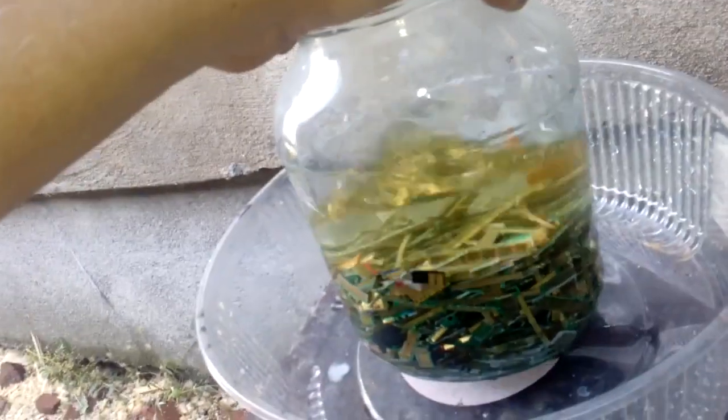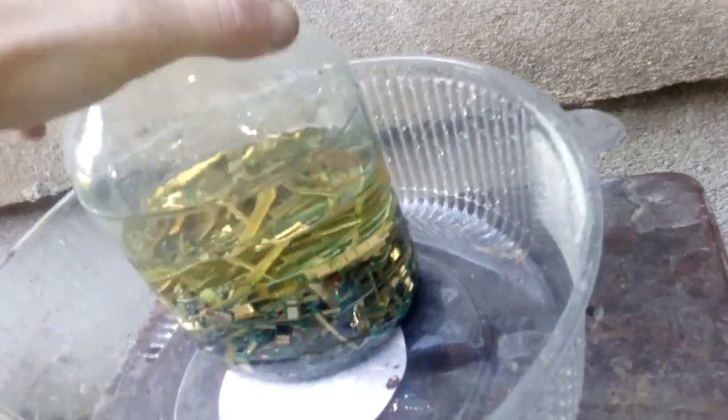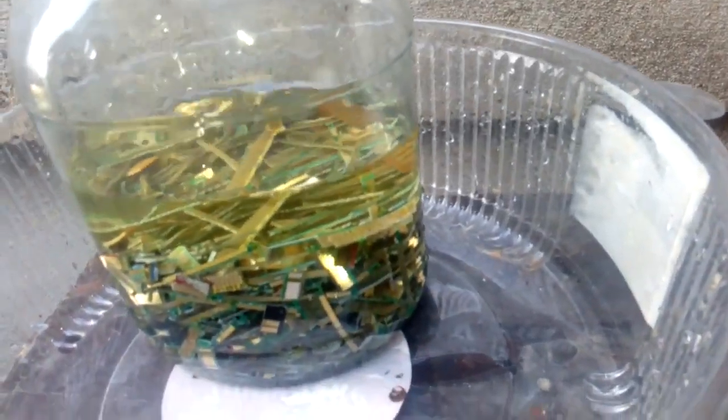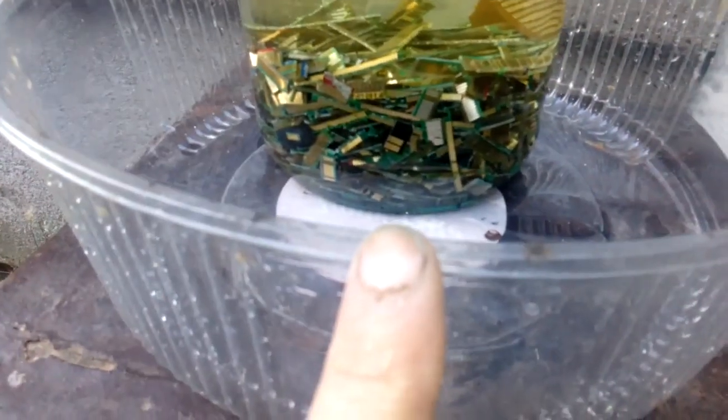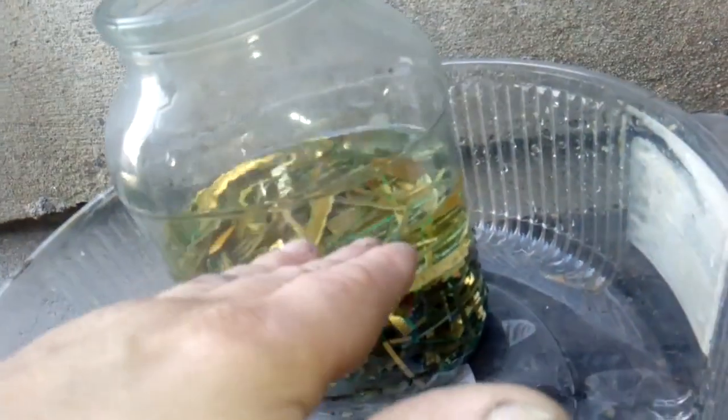Now just a little shake. The reaction already starts — the solution starts turning green and now we leave it. Always use a catch pan because that stuff could boil over the edge. Now we leave it and see what happens for some time. You can already see some bubbles here.